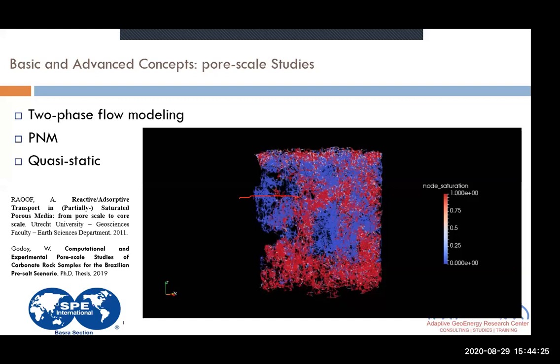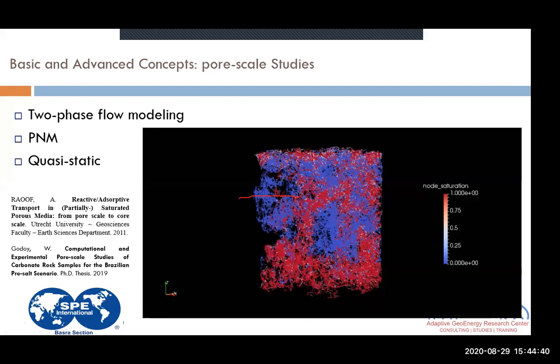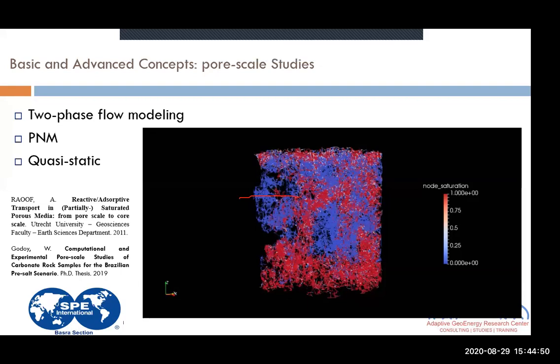Yeah? This one here, it took me some days to perform, but I was trying to check. This is on a complete sample, a plug. I reconstructed all the pore system there using 9 micron pixel size, as I mentioned yesterday. I was trying to capture the peak of distribution of the pore radius there, and using this 10 micron voxel size, I could reach this value.